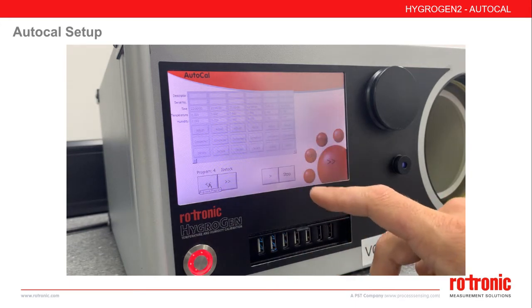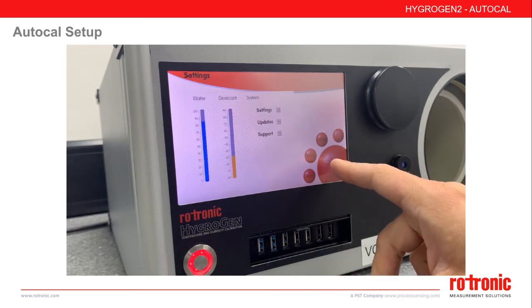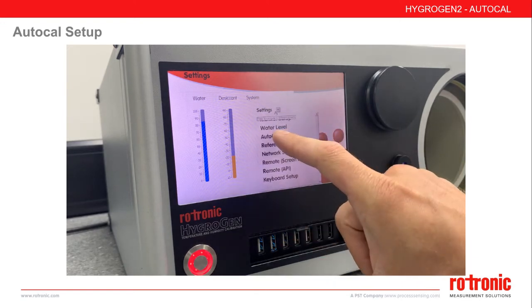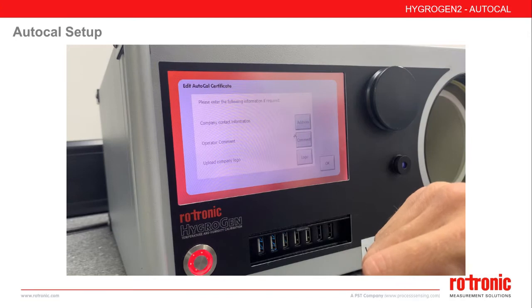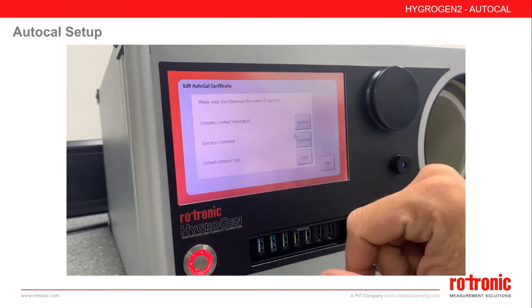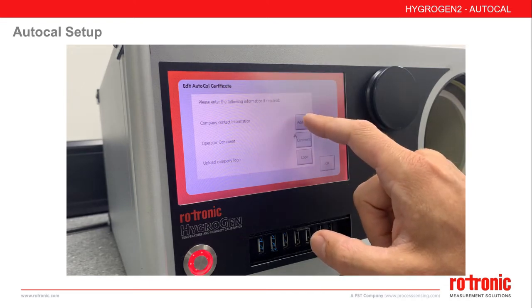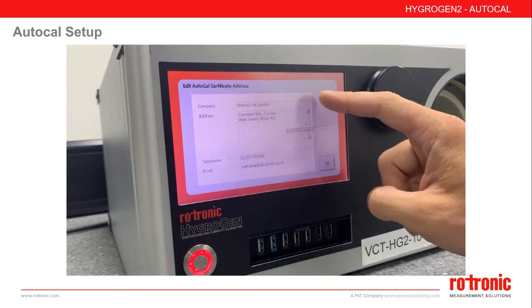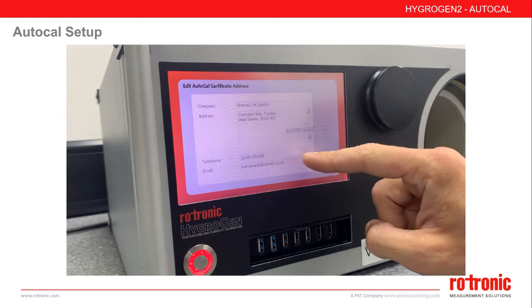Before using AutoCal, we should initially set up. Go to the settings page, select the Settings menu and select AutoCal. From this screen, we can enter important information that will be included on your certificates — for example, your company name, address, telephone, and email.